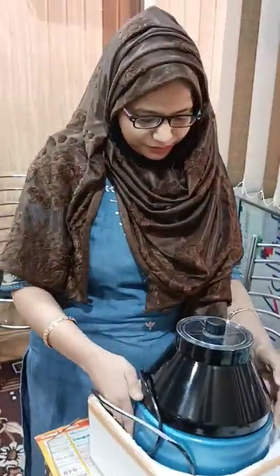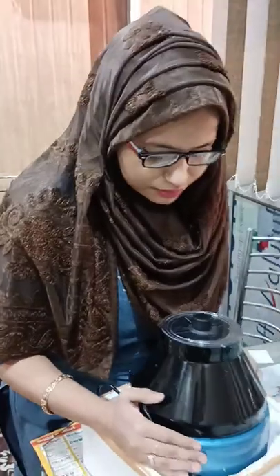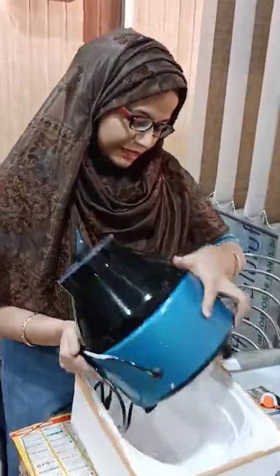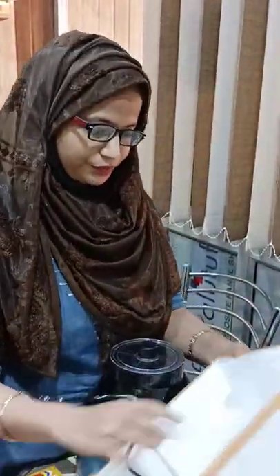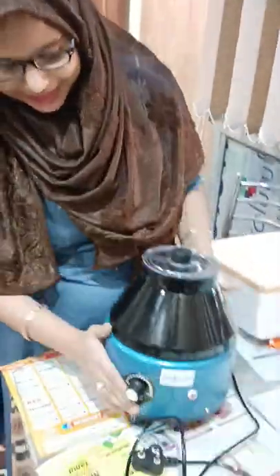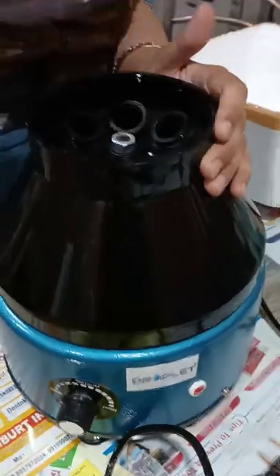So this is the product — this is a centrifuge. A centrifuge is basically used in the industry, and otherwise we also use it for making PRF and PRP preparation. This is the centrifuge, this is how it looks inside.